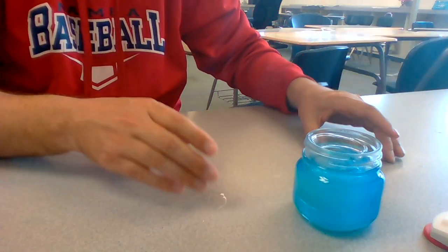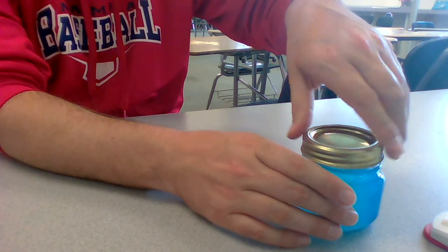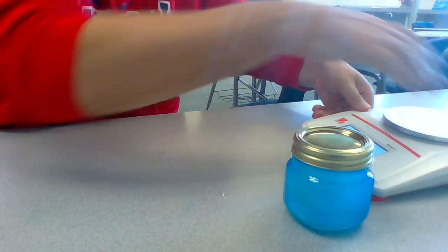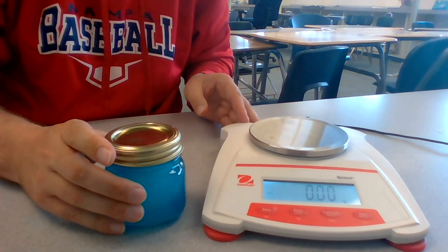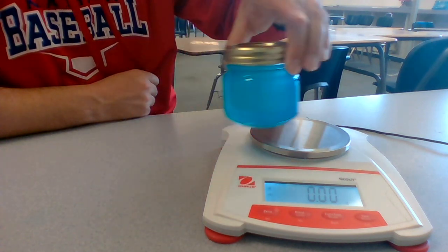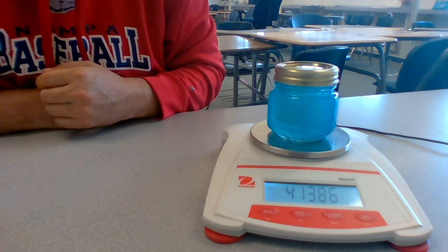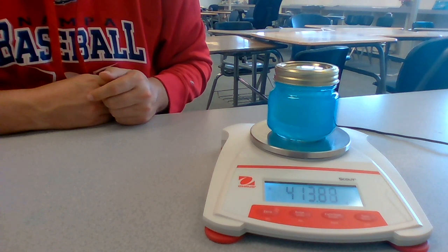All right, got it. And then I'm going to go ahead and put a lid on this. Now we are going to weigh the entire thing on our triple beam balance. If you notice here, it says 0.00. I'm going to place this on our balance. We'll see what this says. It now weighs 413.86 grams. So before the reaction even happens, it weighs 413.86 grams.